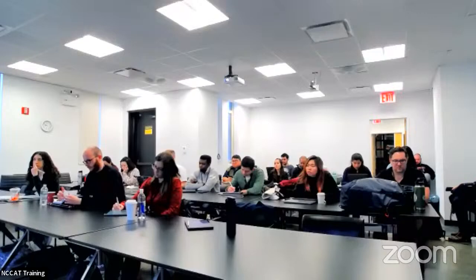Yeah. So let's see. We'll see in the next lecture. No, we'll see next hour that your typical object, macromolecule, has a whole lot more signal in the low spatial frequencies than in the high spatial frequencies.